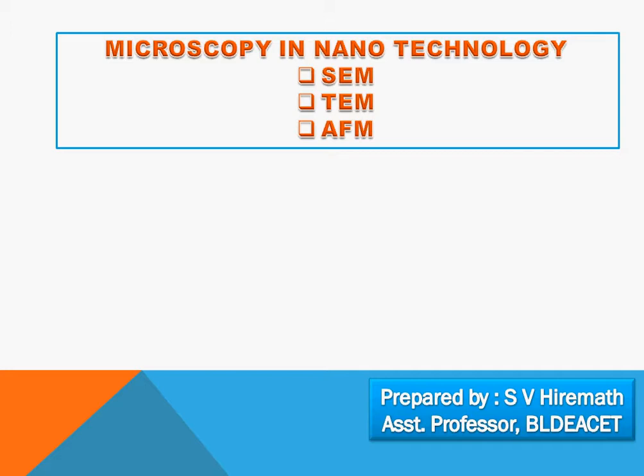Good morning, students. Today we will discuss the various microscopy techniques we use in nanotechnology, such as scanning electron microscopy, transmission electron microscopy, as well as atomic force microscopy. Let us see these one by one.